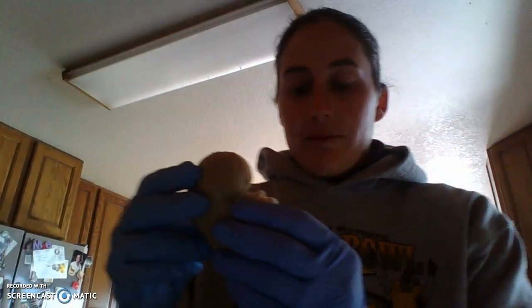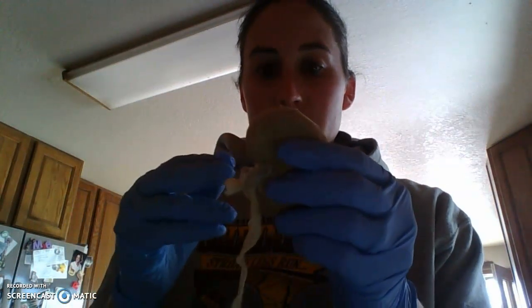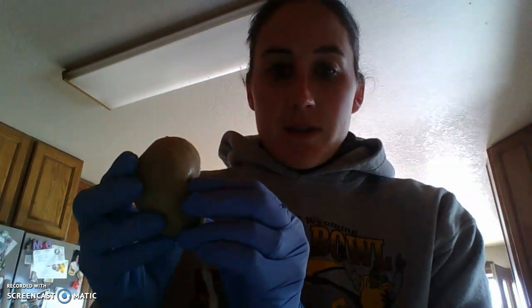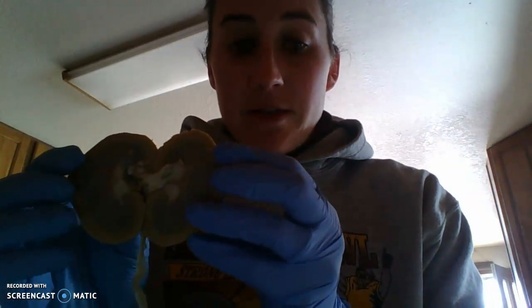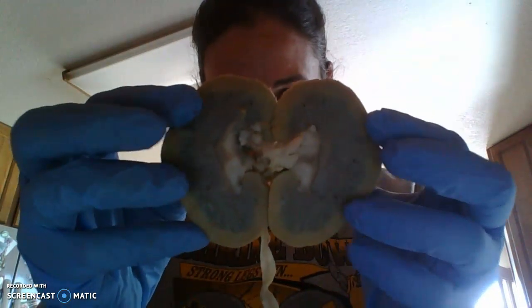For the sheep kidney dissection. Okay. All right. Get my little kidney over here. All right. So this is one sheep kidney. The first thing, the only part of the dissection that we did was just split it right in half. So you can take a look there at that.